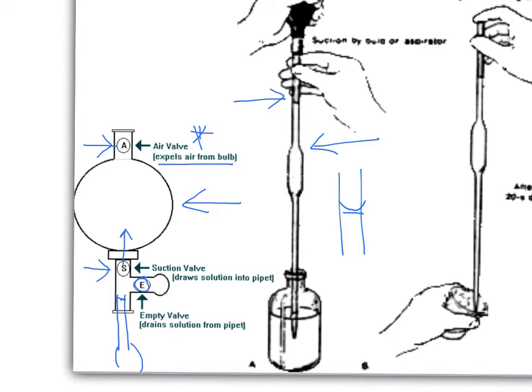Then you're going to squeeze the S and that's going to draw liquid into the pipette and you want to draw it up to that line. So you want to draw it up so that it's probably about two centimeters above that line. So you want to overfill it to start with.